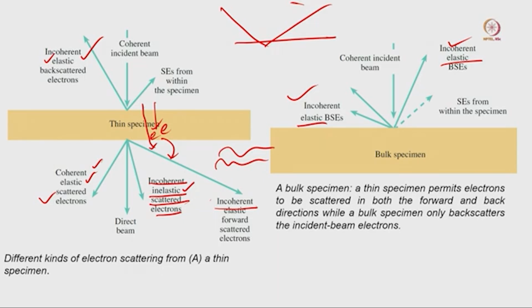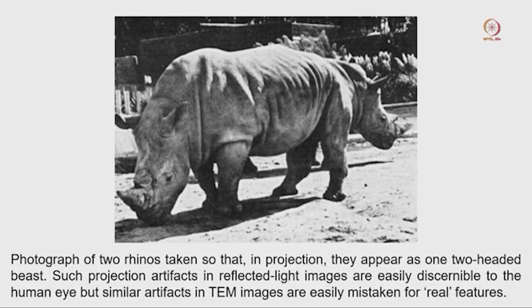That is another difficulty, because we will not get enough contrast. We are going to discuss that at a later stage. But for material science, we can use a huge electron dose that is not going to damage the sample. So that is one of the major differences between material science samples and biological science samples.